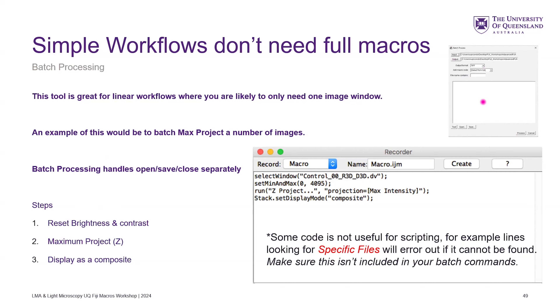It is possible, but you probably don't want a command that says select this specific window, because it's not going to be called that file every time. It's probably going to be something like control or one, and then simply there's three. So you don't want that.